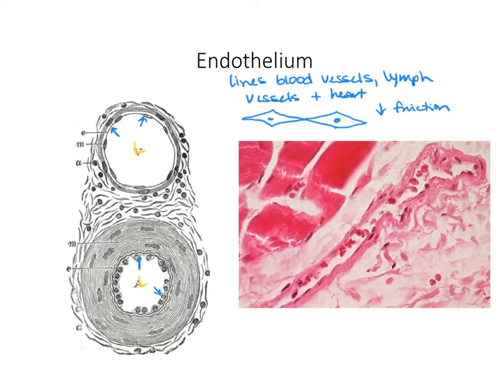So this over here in the picture actually looks like maybe a capillary there, and we're going to see that same endothelial cells here and here and here. So again, you can see how very thin these guys are.